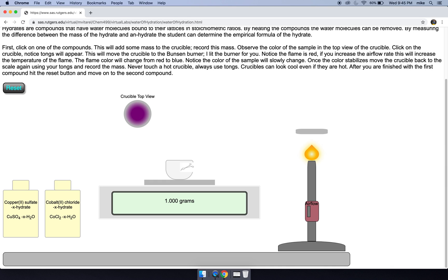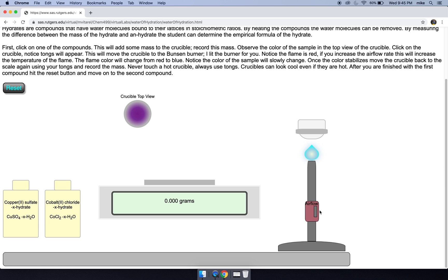So again, we use our tongs and we carry this over here and we increase the air flow rate. The color of our flame changes to blue, a rather hot flame.